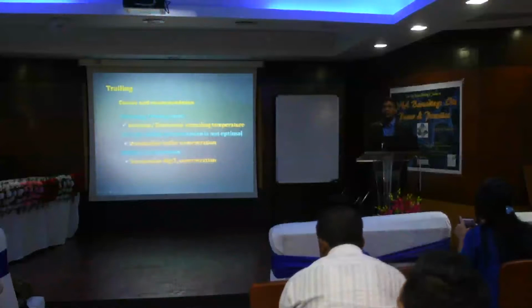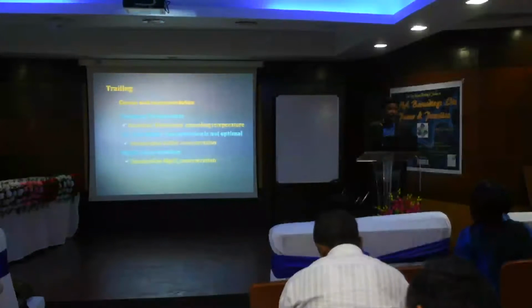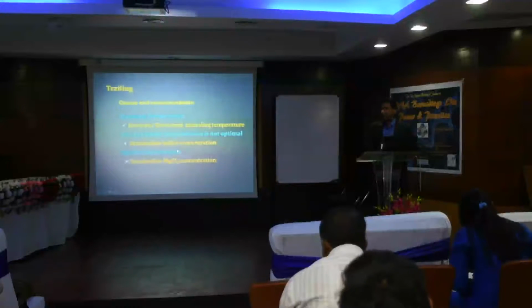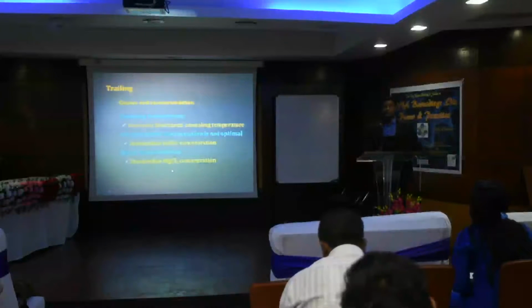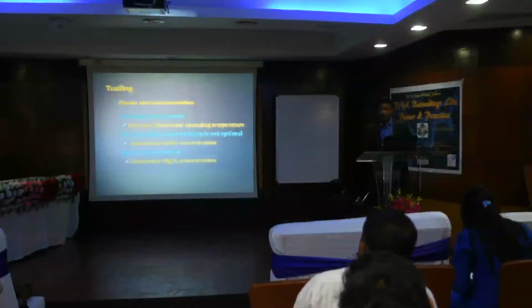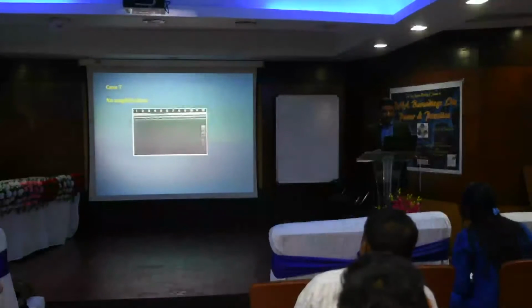So what will you do with the PCR buffer, because you are using ready PCR buffer. Most of the PCR kits you are getting ready. But here also you need to standardize it a little bit. Then MgCl2 concentration also you need to lower. Standardize means lower. You need to lower the MgCl2 concentration. MgCl2 plays a very important role in the PCR reaction. So one should be very careful with that. And once you standardize, you use it.